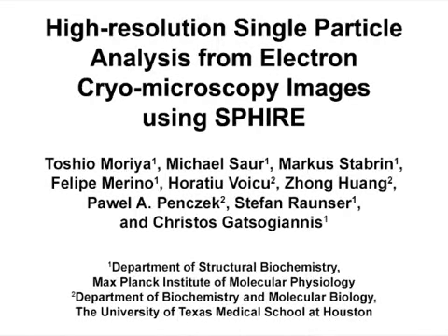The overall goal of this procedure is to determine the structure of macromolecular complexes by single particle analysis of electron cryo-microscopy data using the image processing software SPHIRE.